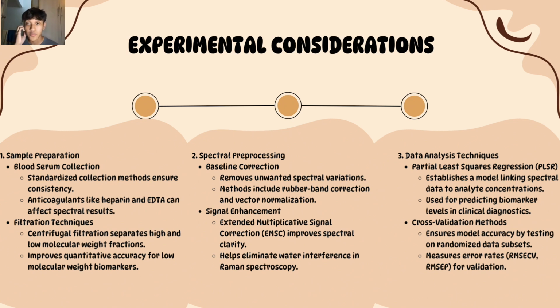The third one that we need to consider in the experiments is data analysis techniques. The first one is partial least squares regression, also called PLSR. It establishes a model linking spectral data to analyte concentrations. It is also used for predicting biomarker levels in clinical diagnostics.